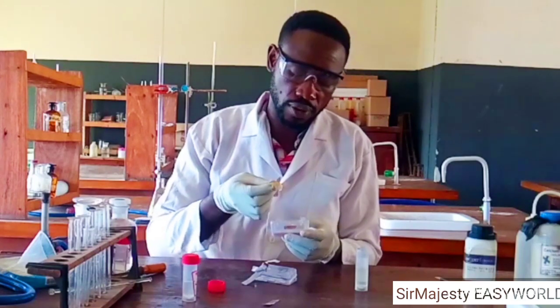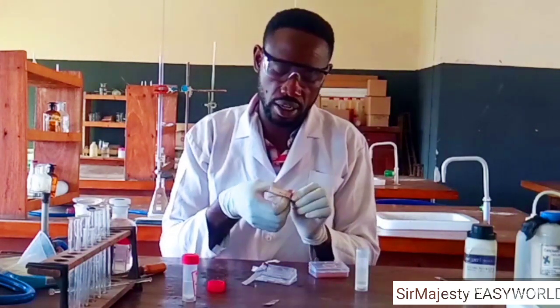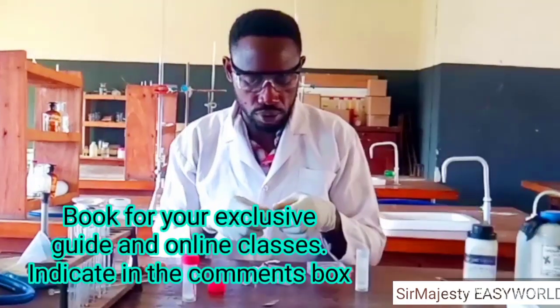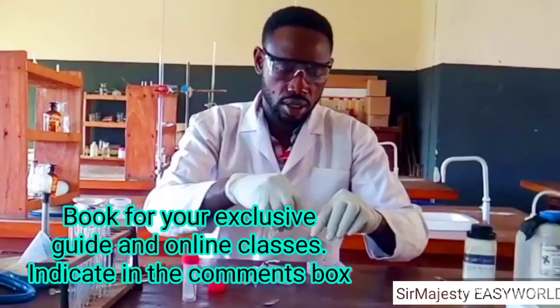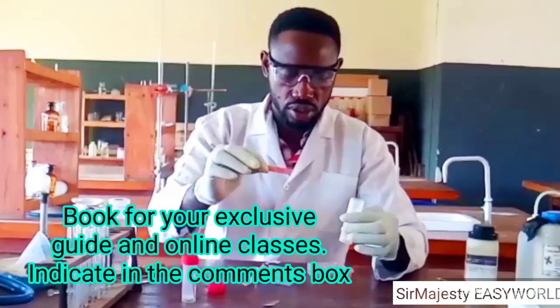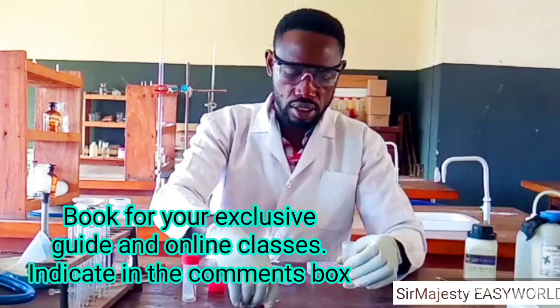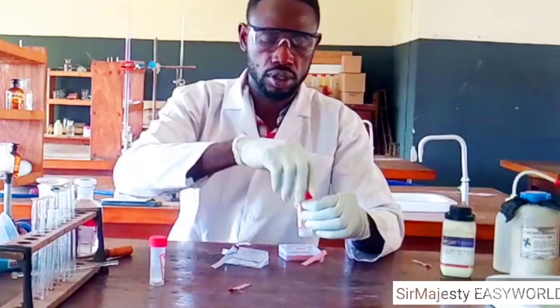That's why I did not do it for the lead nitrate. I didn't use red because since it has affected blue, it won't affect red again. But this one that did not affect blue, let's check if it can affect red. Okay, so no action. So it shows that this solution E is neutral to litmus.